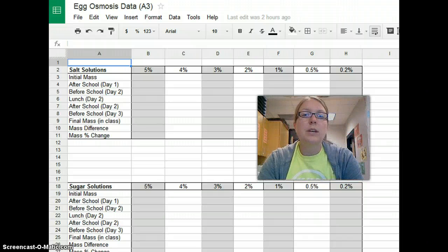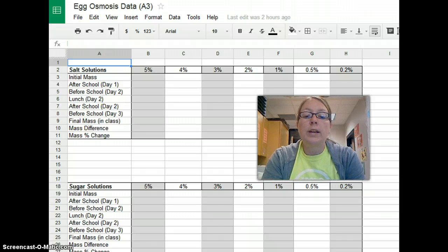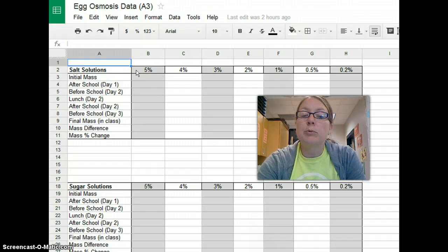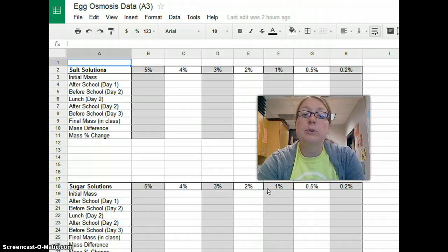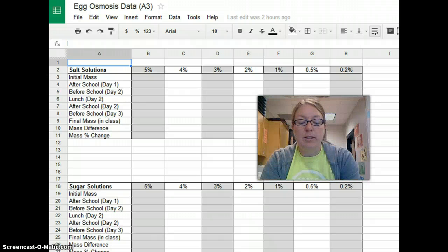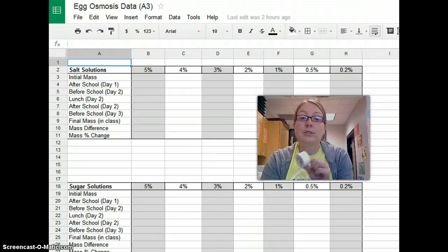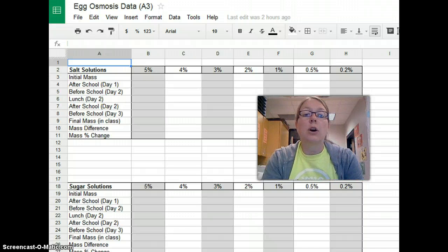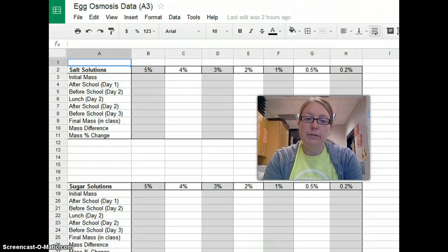What you can do is figure out with your group — on a first-come basis — what particular concentrations you want to do. So there'll be one group doing a 5% salt solution, and maybe their other egg is a 2% sugar solution. As long as they're clearly labeled with tape and your group's initials on the beaker. We have to make sure all of those different concentrations of salt and sugar are sorted out.